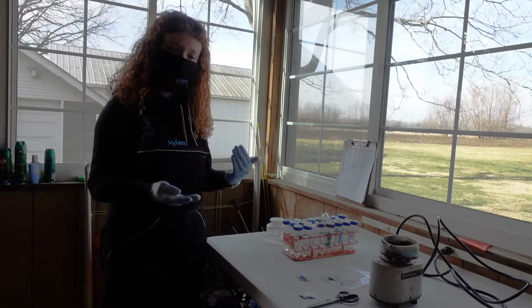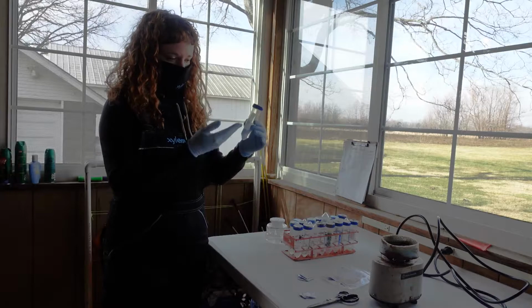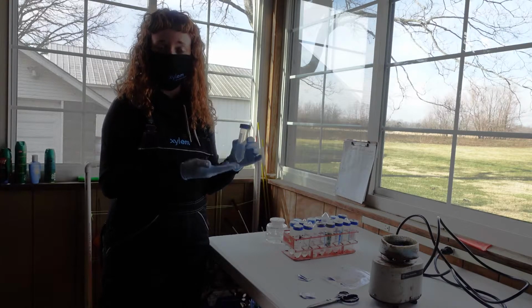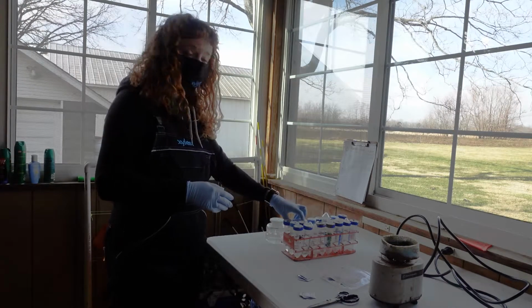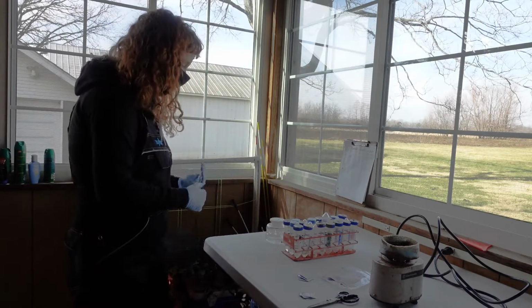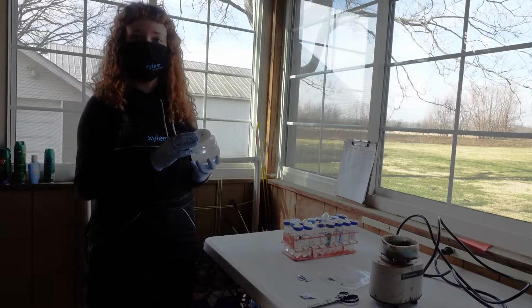All right, so again, when you come in for the day, your standards tube, labeled with the N, will already be filled for you. Your laboratory manager will have filled the reagents in those tubes. The first thing you're going to do is fill your sample tubes. And how we do that is we find our samples that came in from the field. Again, these will all be labeled for you.